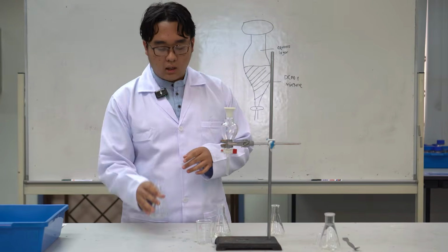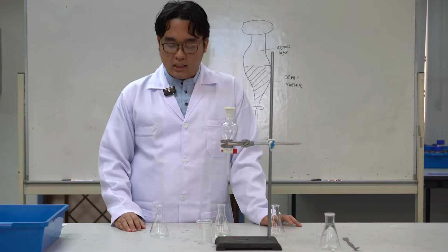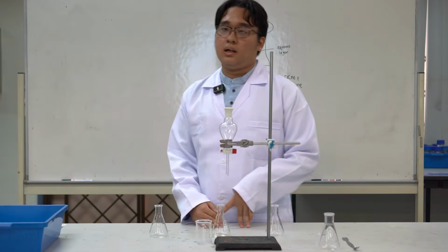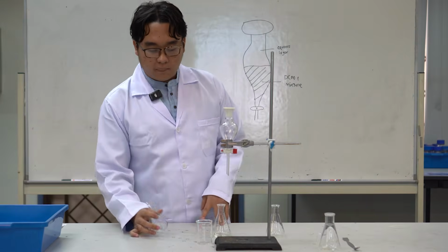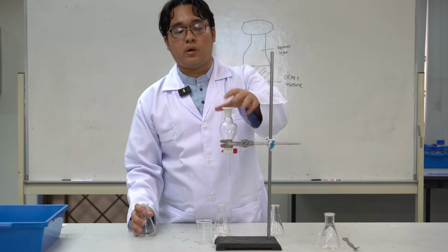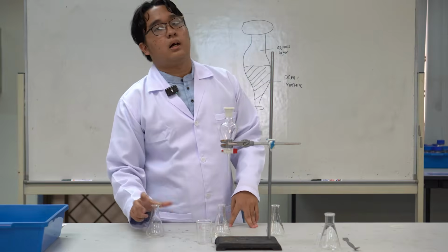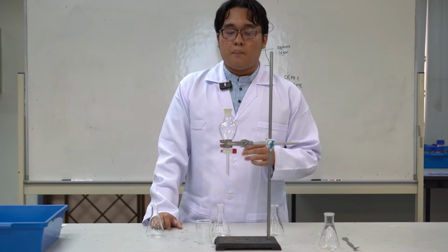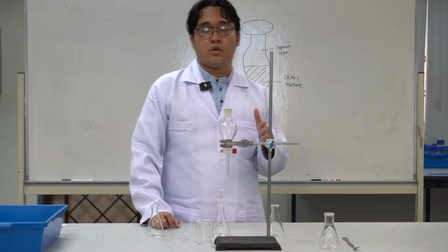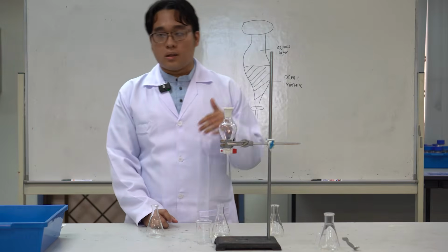So first of all, the key principle here is that we have to add an aqueous acid, and we are going to use specifically 5% hydrochloric acid. So we add it into the separatory flask, and then we also add the mixture from just now. So what will happen is that the base compound is going to react with the aqueous acid and will produce a water soluble salt, which in our case is a water soluble hydrochloride salt.